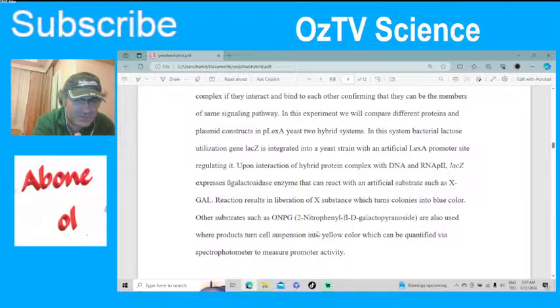Once you turn the gene on, it produces this enzyme, and then the enzyme breaks down this substrate called X-gal. When you break down X-gal, you get X, which is blue color. It turns the colony blue.